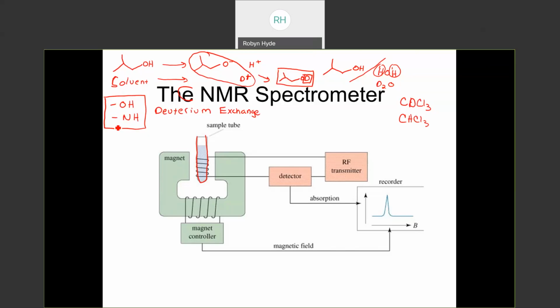On most of the lids, what you'll see is that we've drawn a little line so that when the sample goes in, you can look down, and we have a little flashlight so that you can make sure it is actually spinning. Sometimes we have to play with the airflow just a little bit to get it to spin. With that line, you can tell if it's just sitting there, you can see the line, but once it starts spinning, the line goes invisible to our eyes. So we want it to be spinning. All that goes usually pretty straightforward, great.